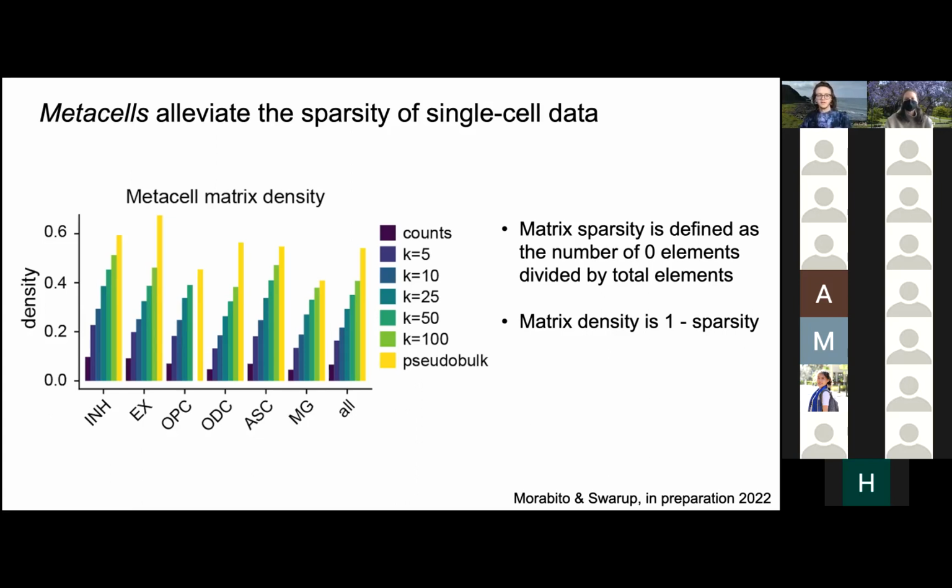And then also I'm going to ask you a question, Sam, that I asked you in 2019 when you first were talking about this, which is, would you ever want to scale K based on the number of cells that are in your cluster, the number of cells in your sample and cluster combination? I see what you're saying. Technically you totally can do that.